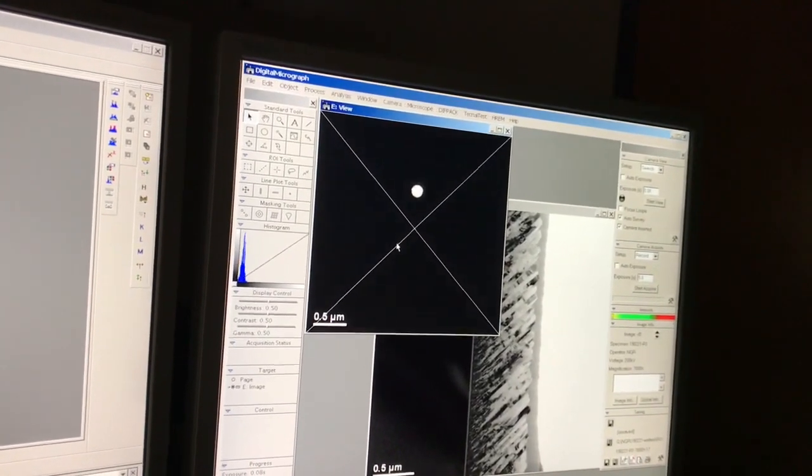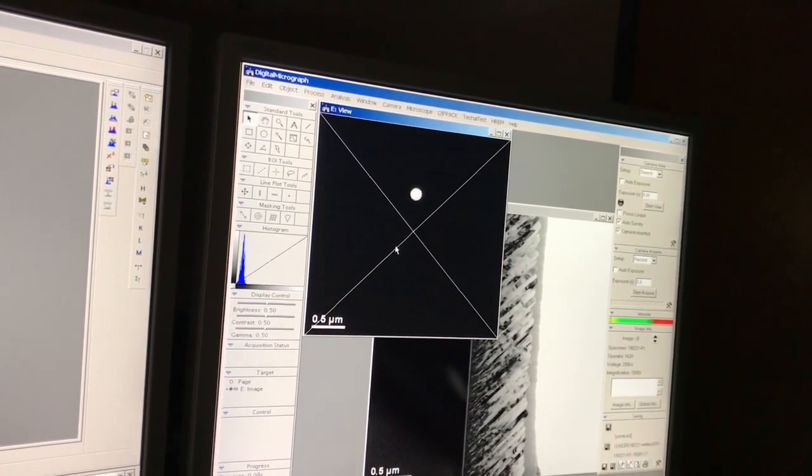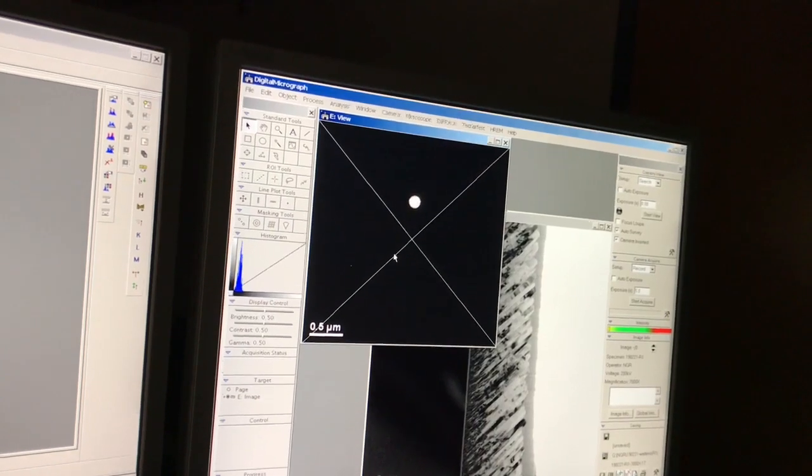Okay, so in that case, my limiting size is literally determined by the area that I'm illuminating. So I'm going to go ahead and come back here to the viewing screen, flip this down. I'm not going to go into CBED in a lot of detail here, just to start with. It's probably a little hard to see. I'm going to take out my beam stop here though, because we don't need it in anymore. Pull it out, rotate it away. But you can see that's the area I'm illuminating. I have no SA aperture in.